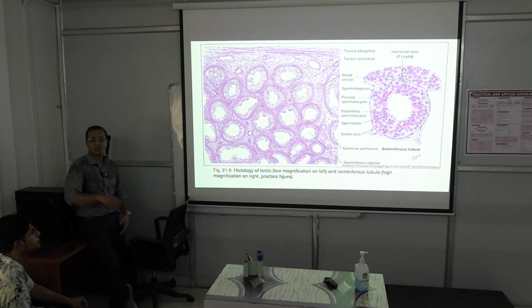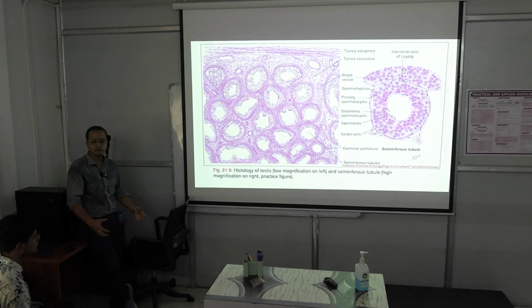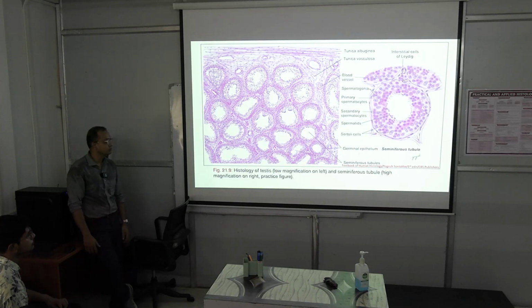So, we have 5 or 6 slides of different histological content. Some of them are ovary, some are fallopian tubes, some are testicles. So, go and see them, identify these tissues, and that is it.